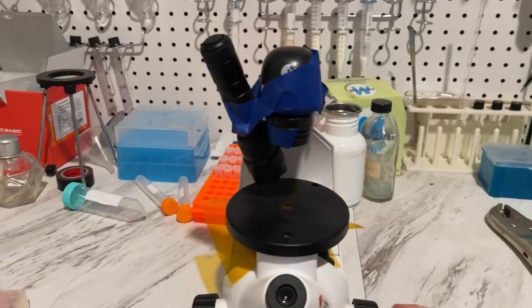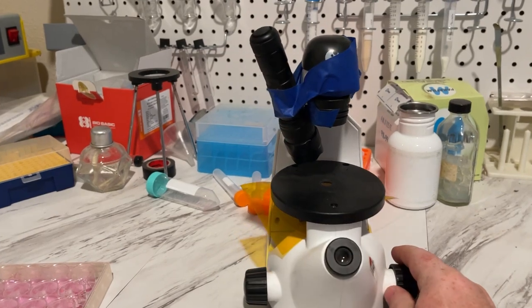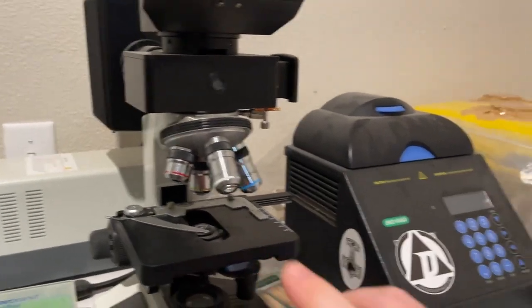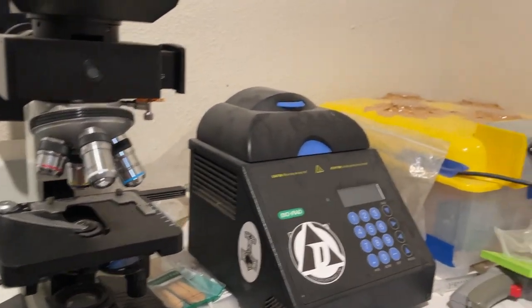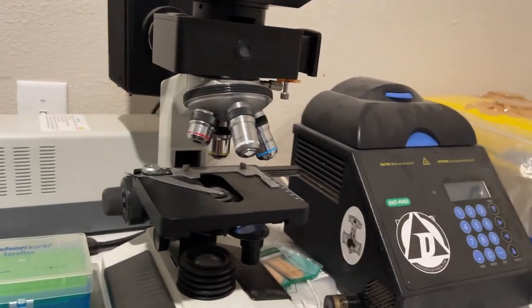Another problem with this is this actually uses UV light, which is a really high-intensity beam, and it gives you a huge amount of detail, which is really nice when you're looking at small things like bacteria. But relatively large cells like these human cells, you don't necessarily need that intensity of light.